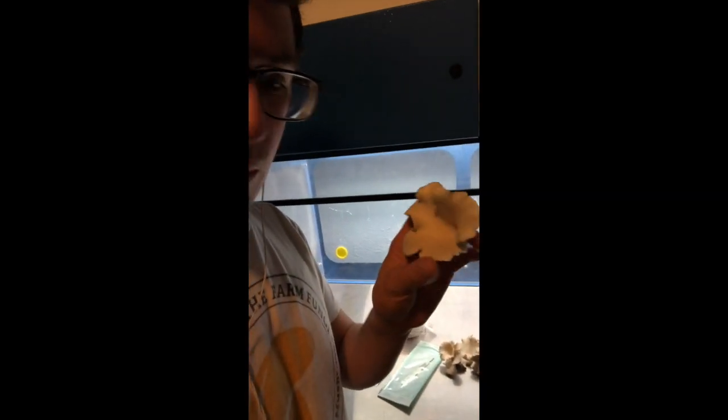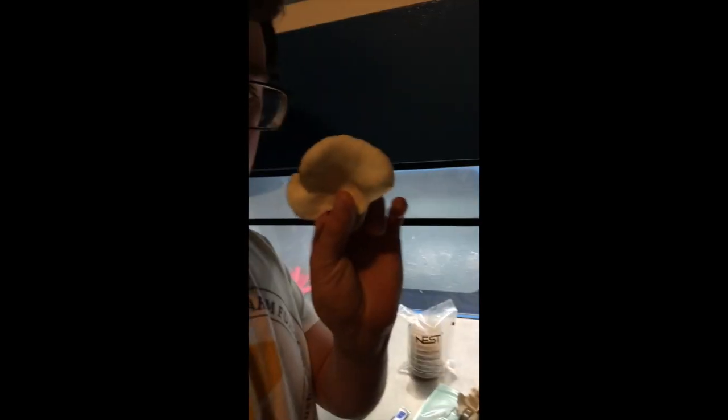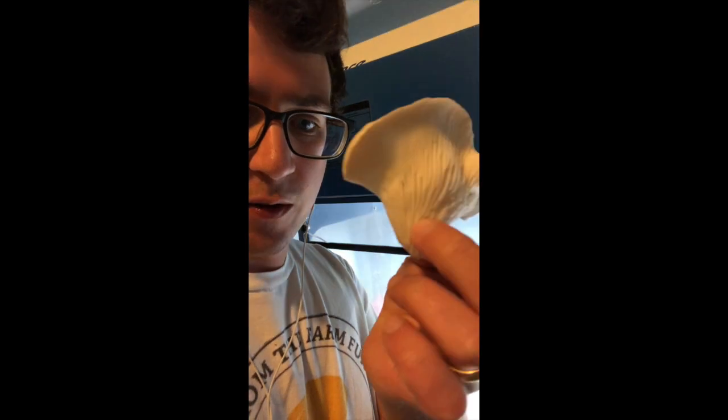On this one right here you can see it's a lot more delicate and kind of wavy looking. It never really fanned out like the other kind of oyster, so I'm going to be taking cuts from this fruiting body here.